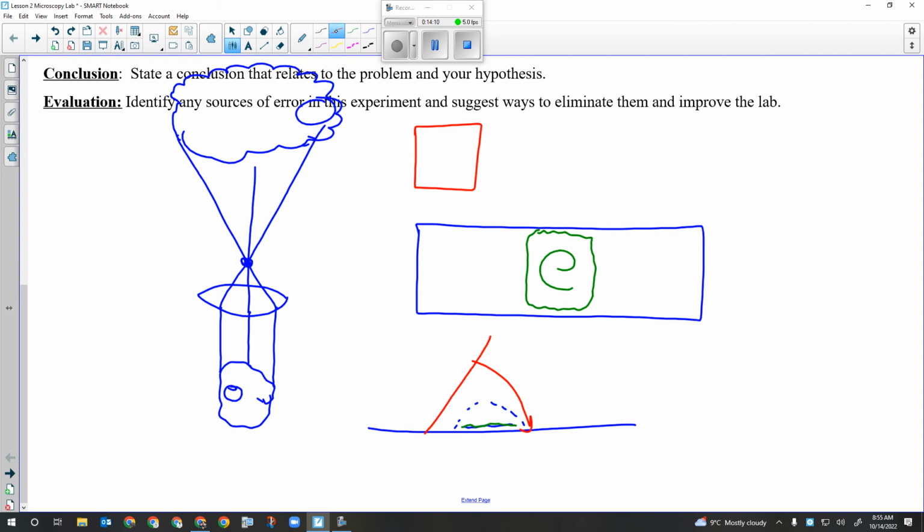And the letter E is about the only thing we look at where you can tell if it's right side up, backwards, mirror image, inverted, whatever. So that kind of makes sense? That's the whole reason we look at the letter E. If I look at an amoeba, I don't know if it's upside down or backwards. Amoebas are blobs, and they look the same no matter what. All right, so that'll be how you make your letter E.